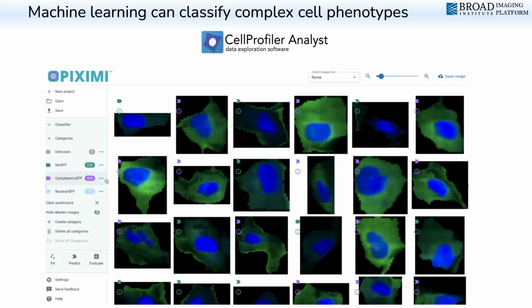For example, if you have metastatic cells in cancer, they are these really strange-looking cells, and it's very hard to pin down the one thing you're looking for. Or if you have migratory cells that are moving around, it's hard to specify the parameter you want to measure. But instead, you can take a very different approach. This is something you might be very familiar with, which is a standard sorting approach in machine learning, like in your Google album or whatever app you use, if you want to be able to identify faces, right?